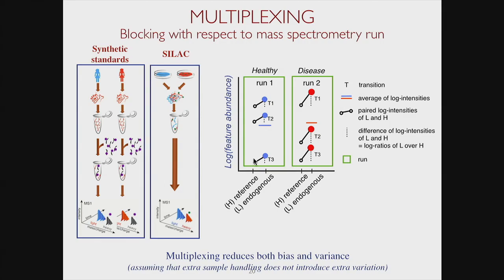And remember, the reference intensities are supposed to be constant. But we see that we have a lot of variation between the reference intensities in this cartoon. So this means that we just happen to have a lot of technical run-to-run variation when we acquire the data. All of these differences in intensity are not due to biology, right? They're just due to some kind of technical artifacts.